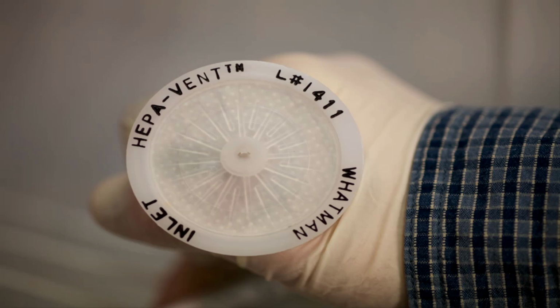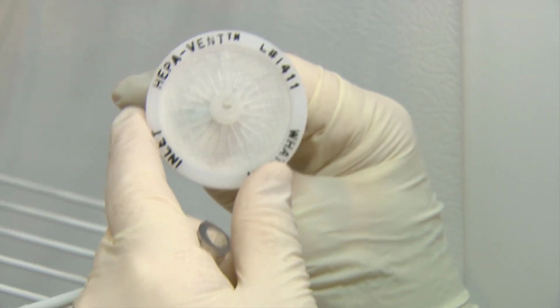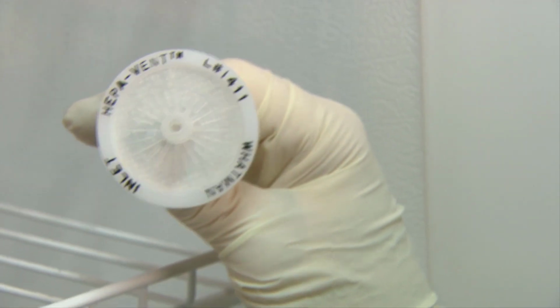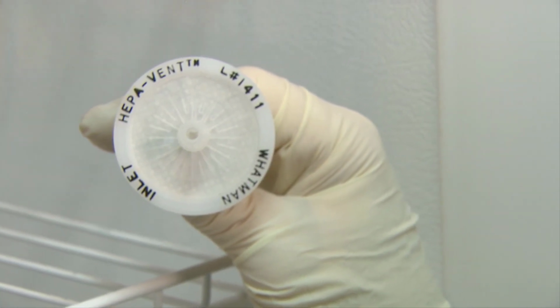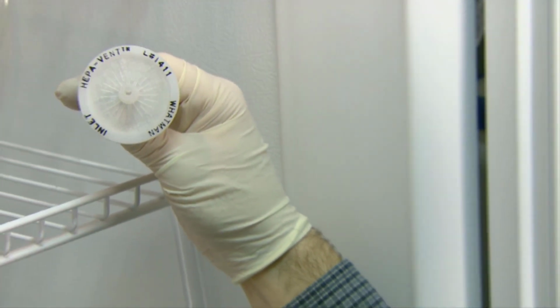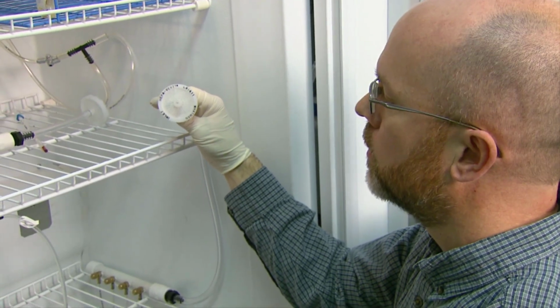You also notice that our aeration apparatus has this inline filter. Because we're just pulling in regular air from the outside, I mentioned in previous videos that there's algae, fungus, bacteria floating around in the air. So it's important to have this air filter in line because that's another source of contamination to your culture.